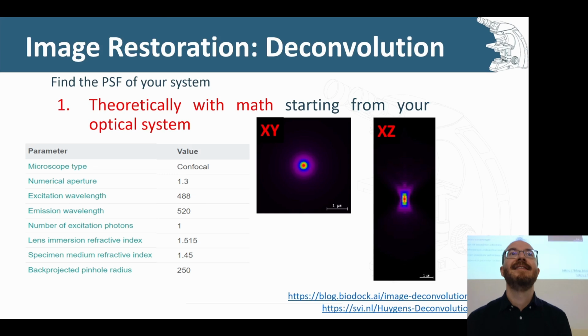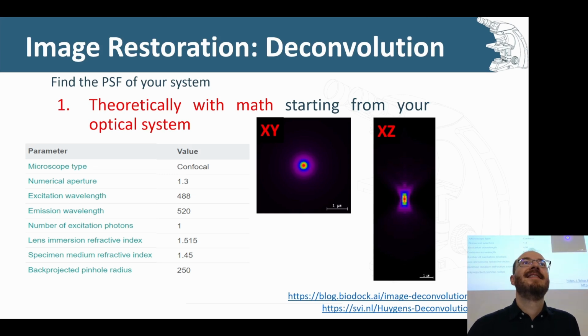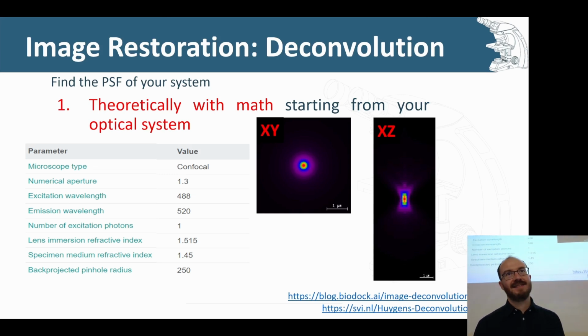So yeah. The fact that you actually get a range of emission, does that affect the... Yes, it does. So ultimately, when you set up a point spread function, artificially you set up for a specific wavelength.